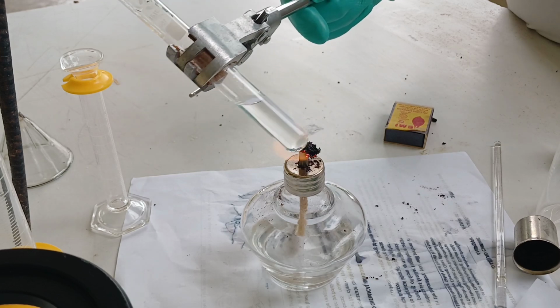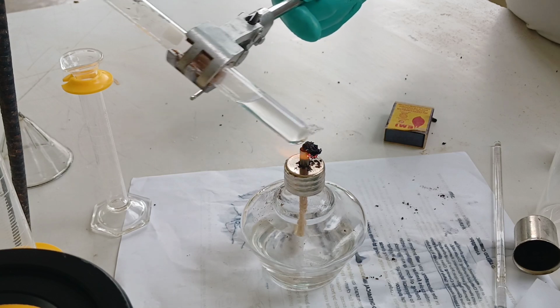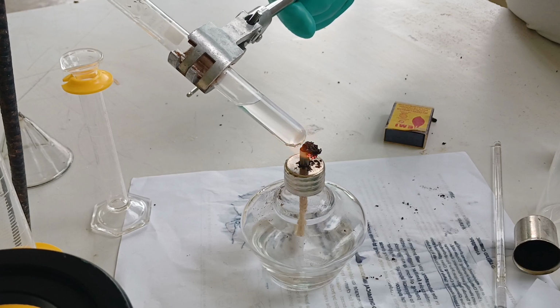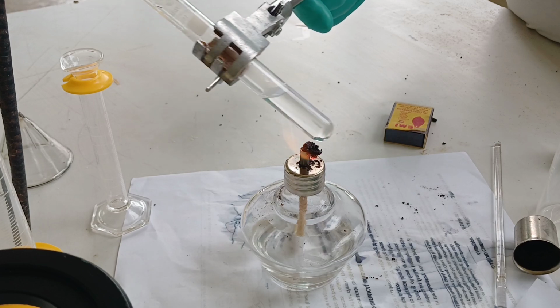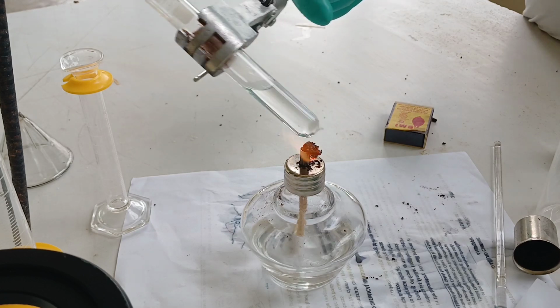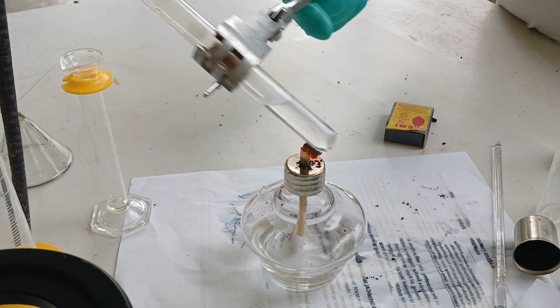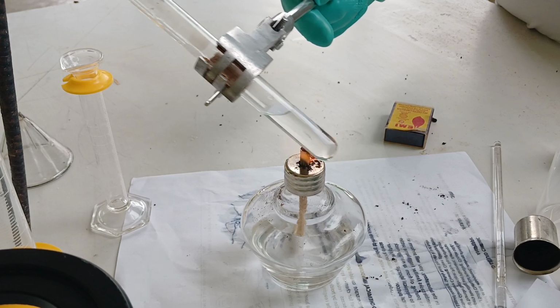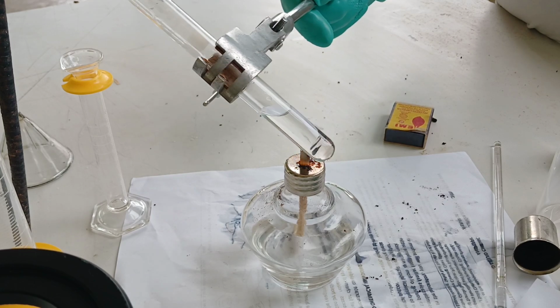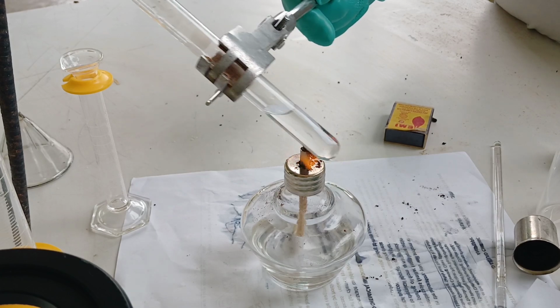Yes, hold the test tube using the test tube holder in a back and forth motion. Back, forth, back, forth. If you observe, you heat only the filled portion of your test tube where the liquid occupies, at the bottom. Do not heat the test tube in the empty space. It may cause breakage. And of course, your sample is at the bottom. That is your subject of interest, so you heat only that portion.